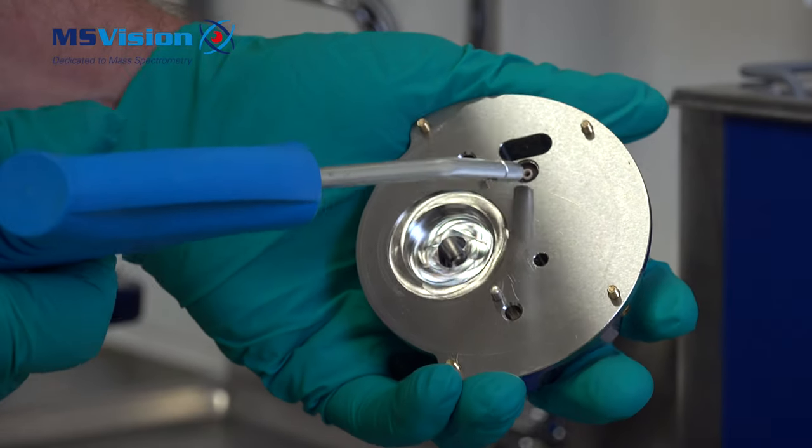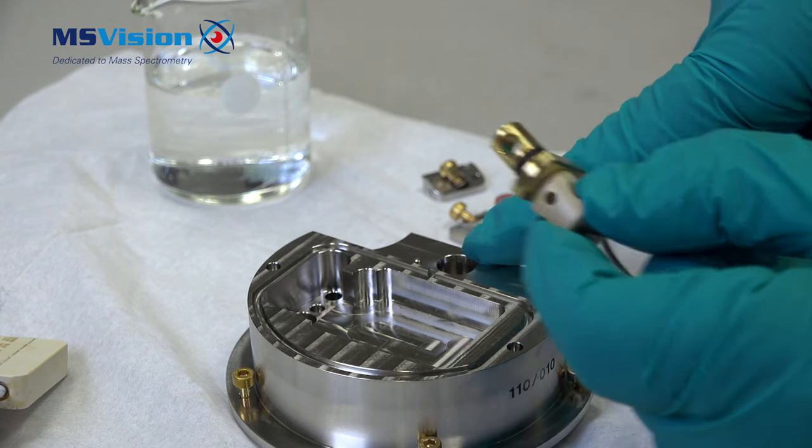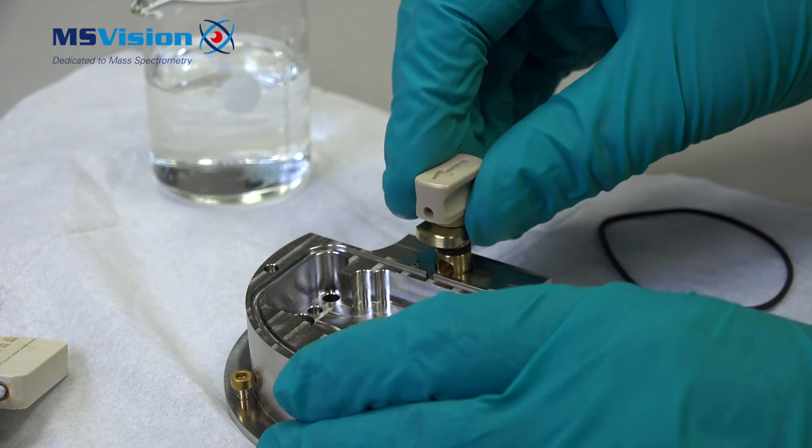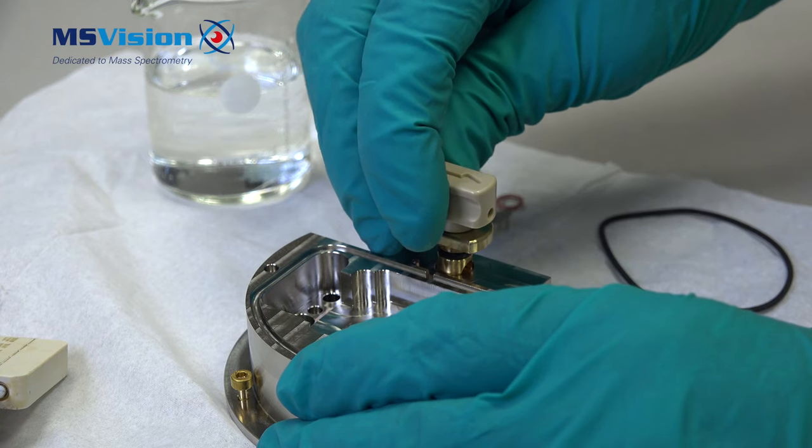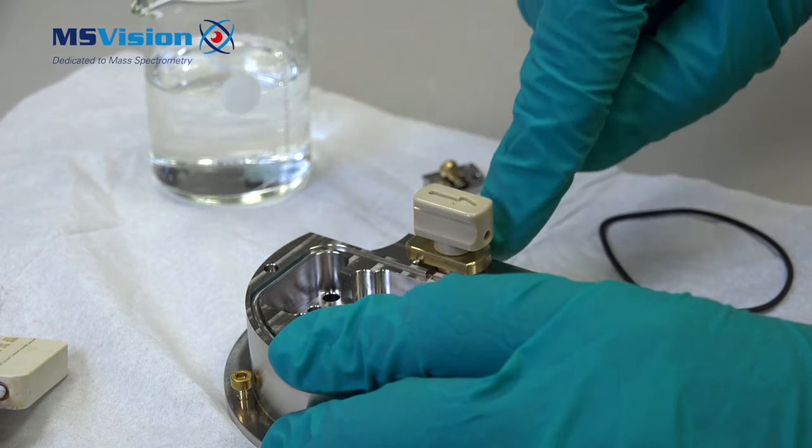After the methanol and blow drying we can reinsert the valve into the source block. Remember this is open and this is closed. Push firmly in.